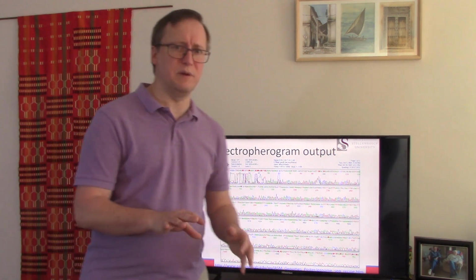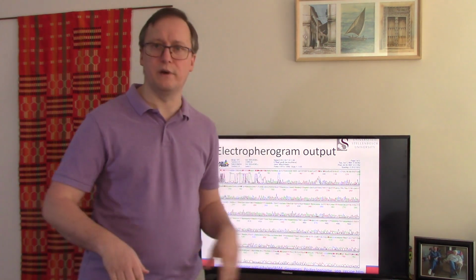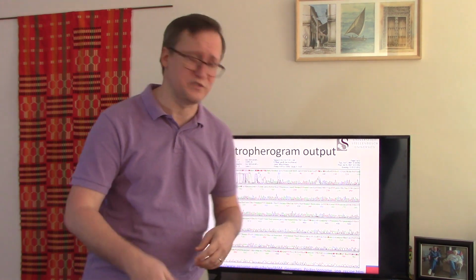Now, I think most people will remember, if you took analytical chemistry, that the bigger a molecule is in comparison to the difference between it and its neighbor, the harder it is to separate them. What that means practically is that when you get up past 500 in the number of nucleotides represented in the complementary sequence, the weaker the ability of capillary electrophoresis to tell those two fragments apart. 500 nucleotides versus 501 nucleotides is, after all, a pretty small difference relative to their total size.